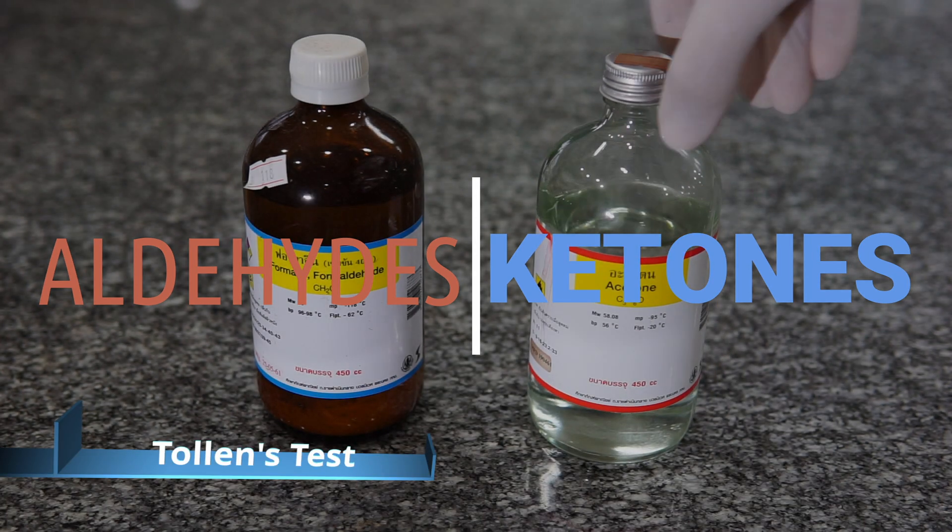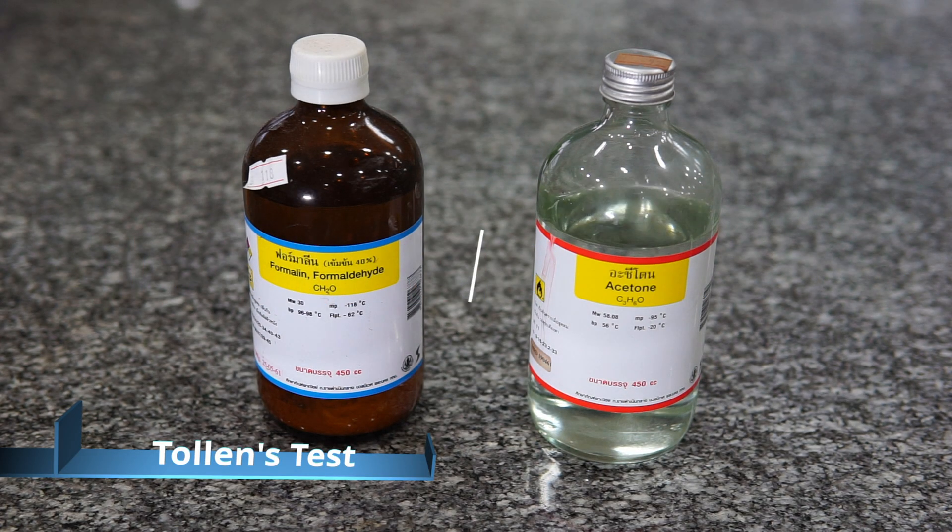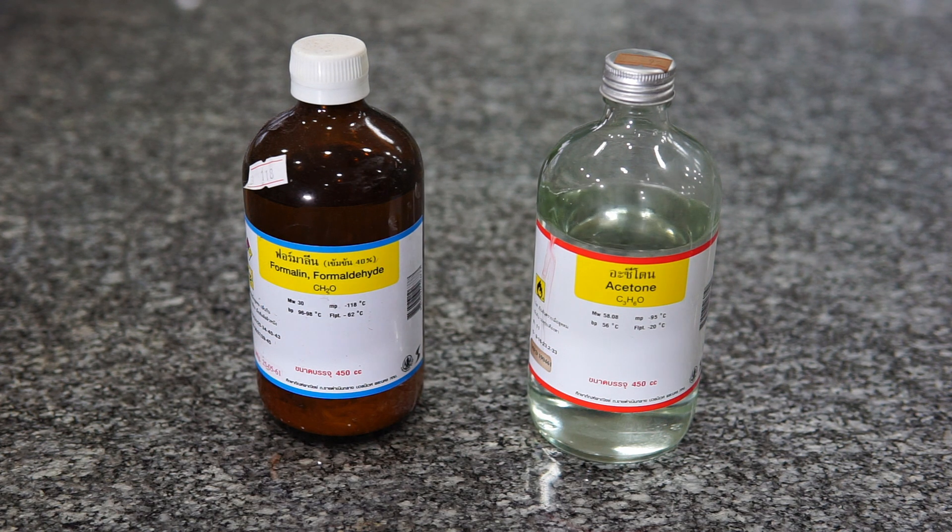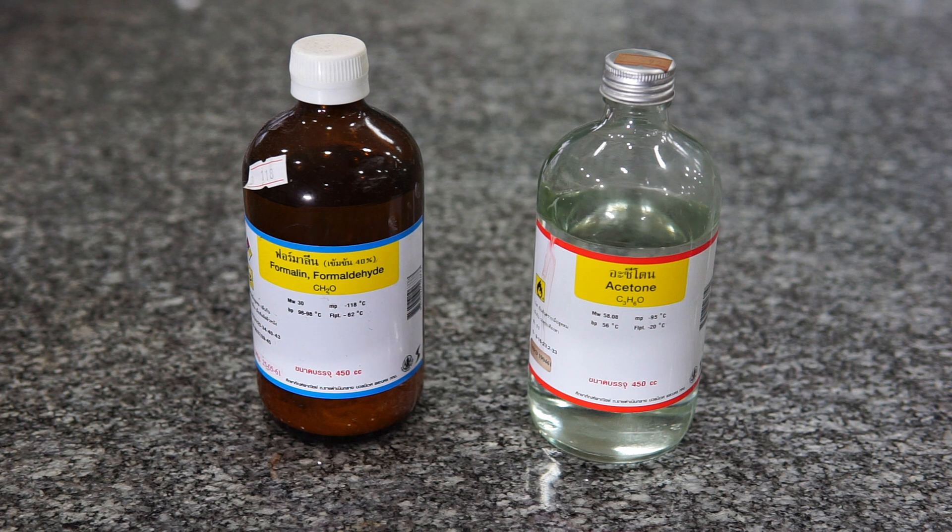Here we have an example of two common compounds. On the left we have formaldehyde, or rather methanal, and on the right we have acetone, otherwise known as propanone. In this video we'll be looking at the test to distinguish between these two types of compounds easily.